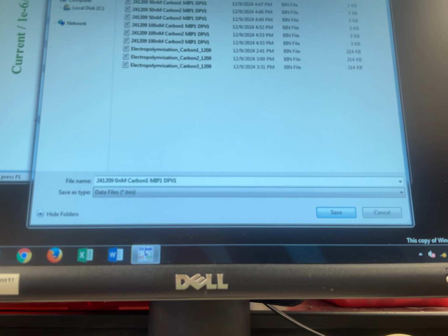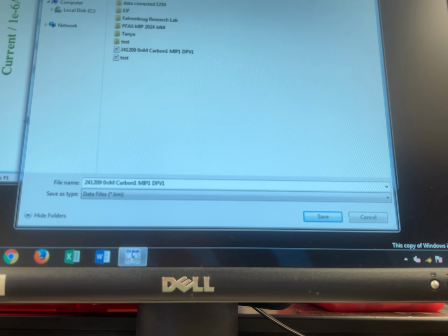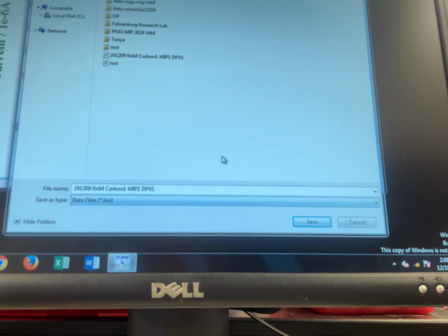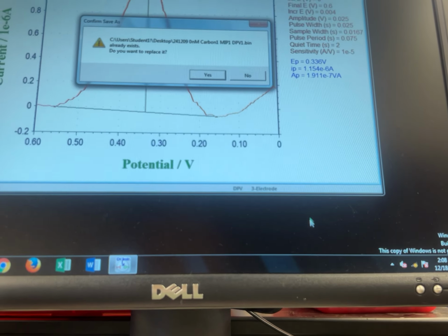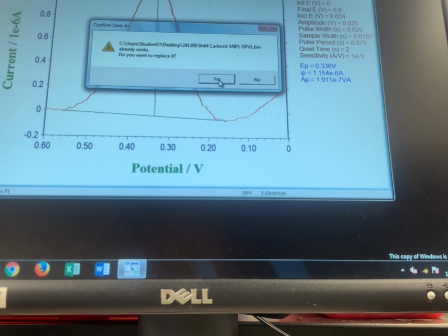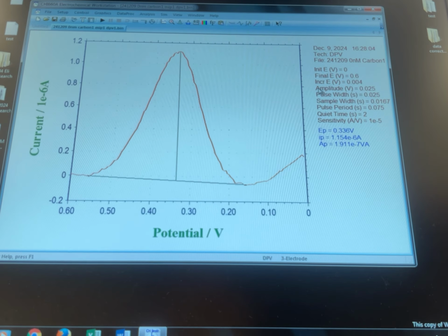This time I will save it on the desktop because it's just a task. So I will click save. Yes, and that's basically it.